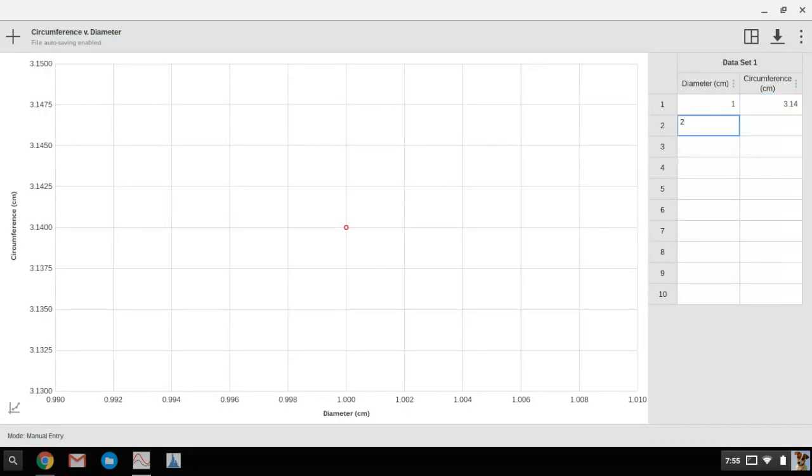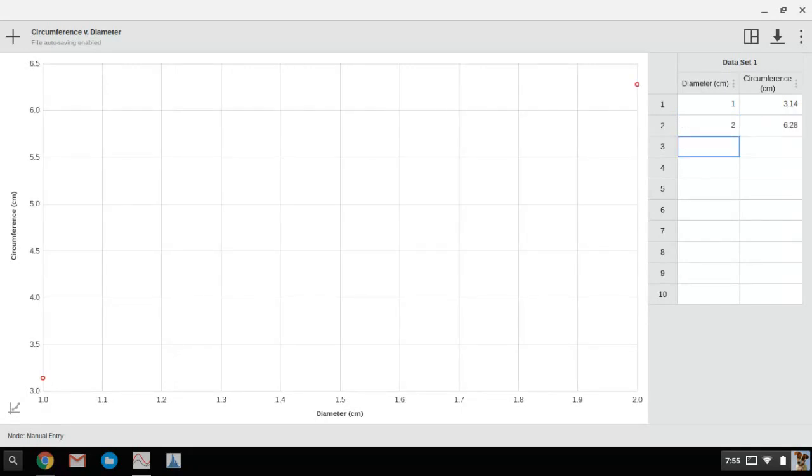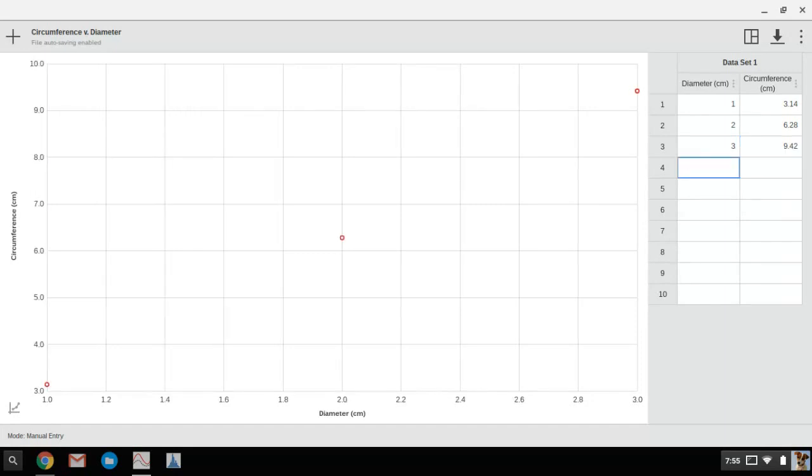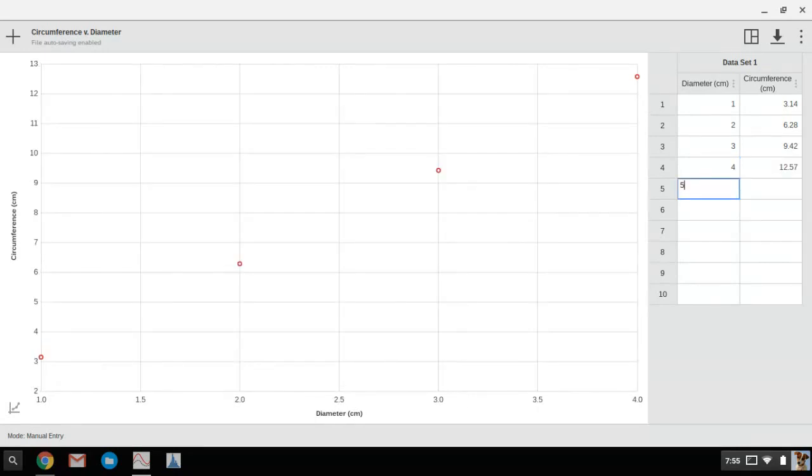And then at that point we're just going to be entering in the data. All I'm doing to move between the boxes is hitting enter. You want to make sure that you're entering in the correct information in the correct columns so that your graph turns out correct.